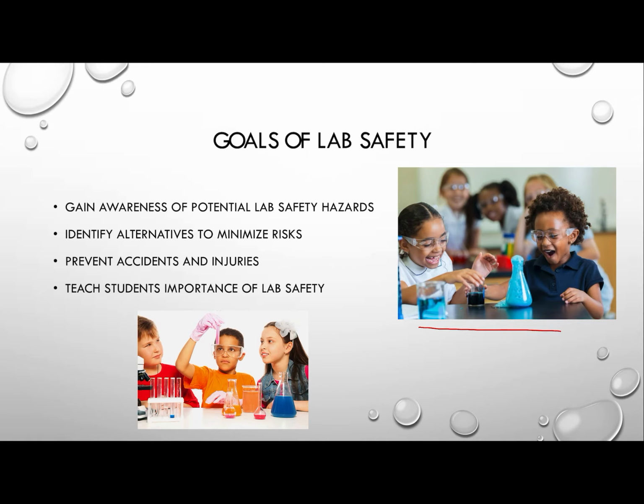It looks great. When we're looking at this image right here, this is a common mistake. This young man has gloves and glasses on, but yet the young lady to his left and the young man to his right don't have goggles and they don't have gloves on. And to think that they're protected just because they're not holding the test tube, well, that's a common mistake. They are likely to be hurt, just like this young man is here, but they don't have the proper protection to protect themselves should that test tube fall, spill, or if it got hot and exploded for any reason.